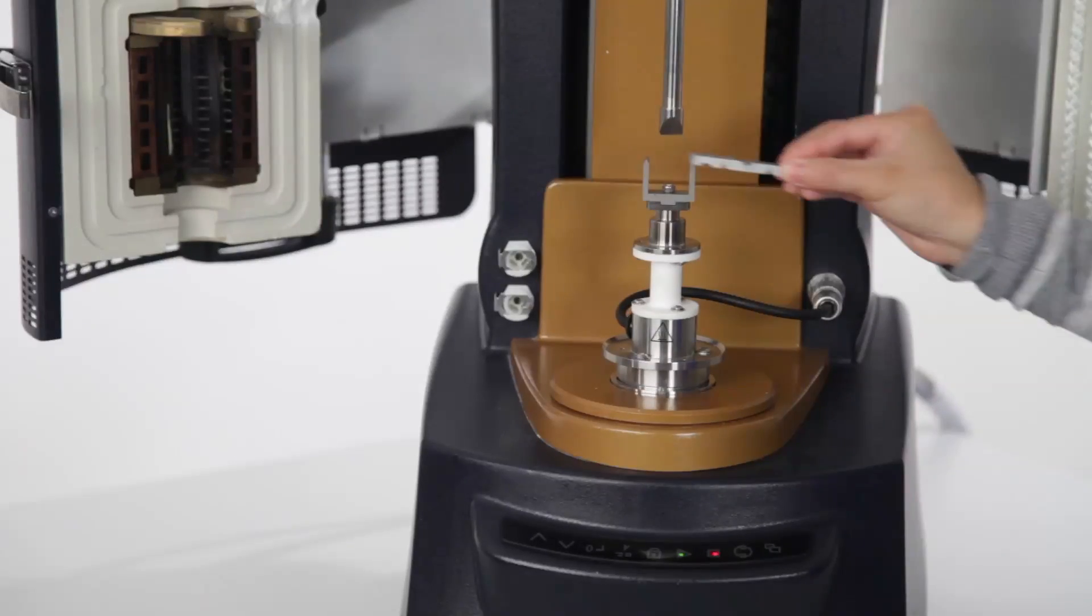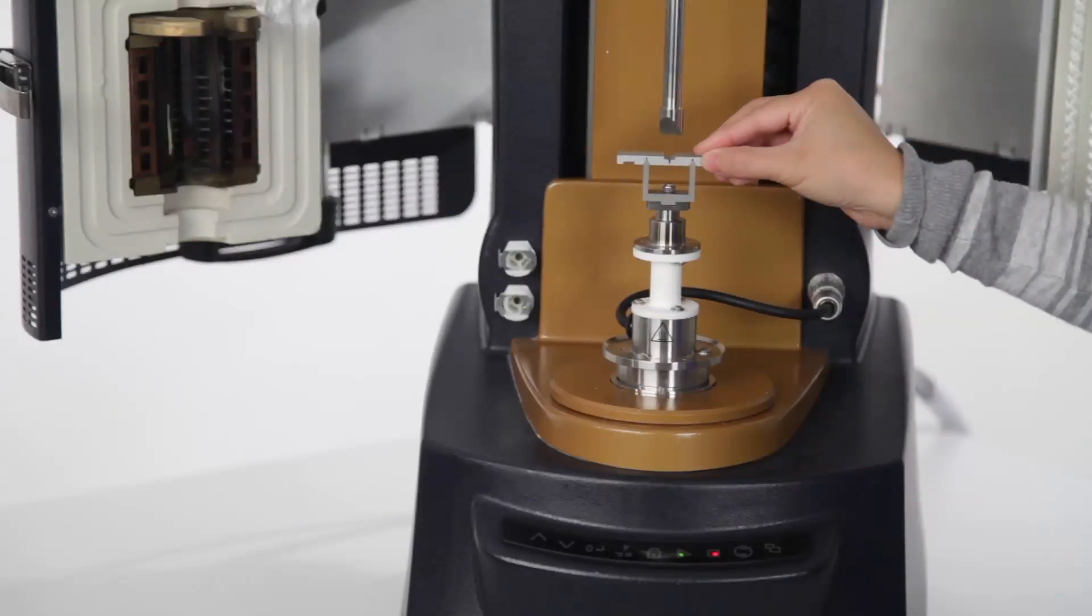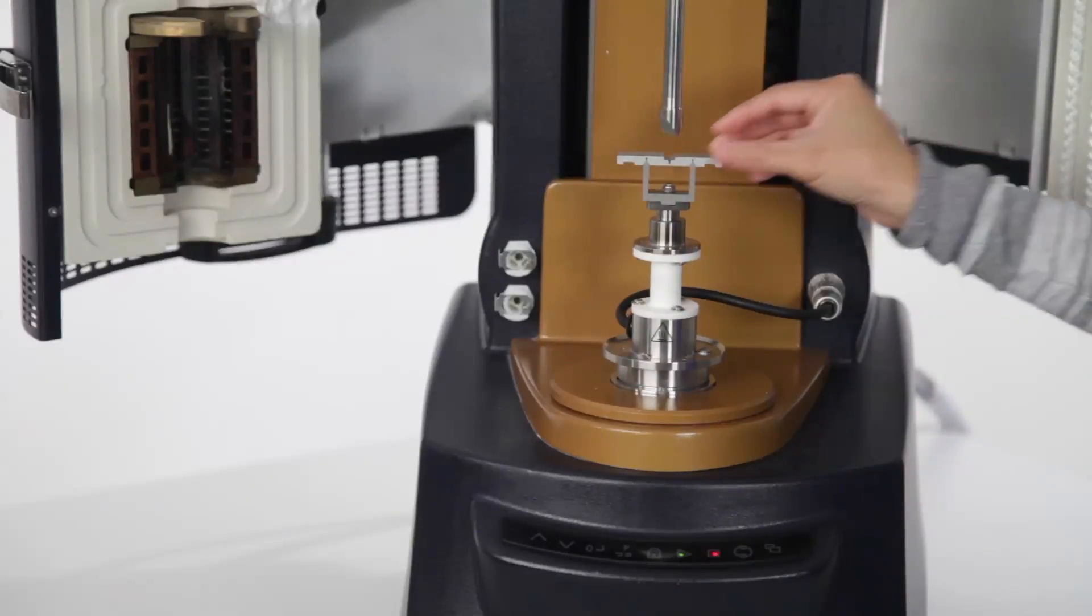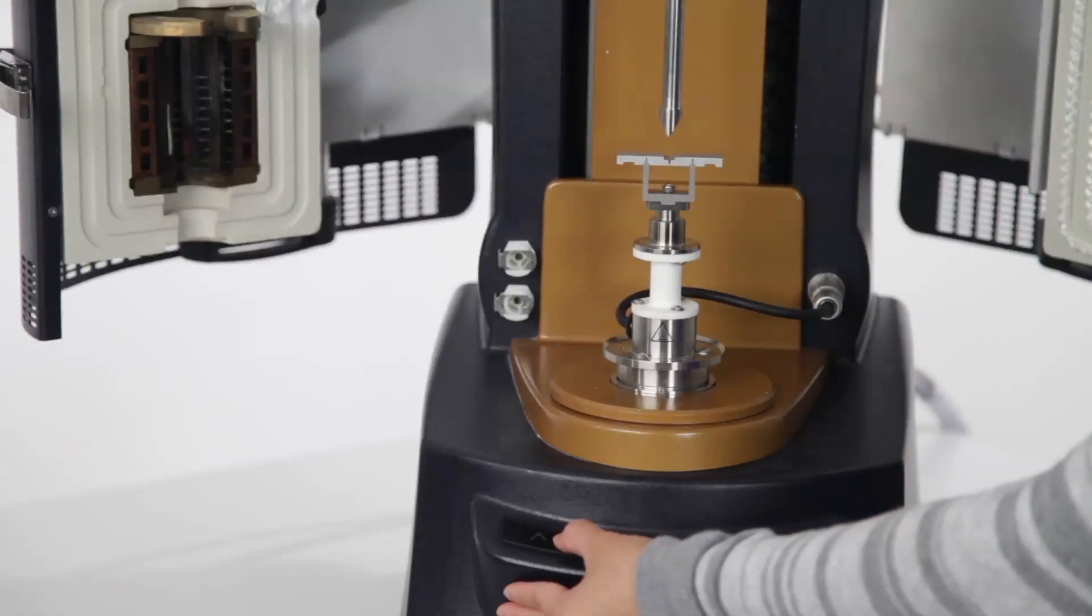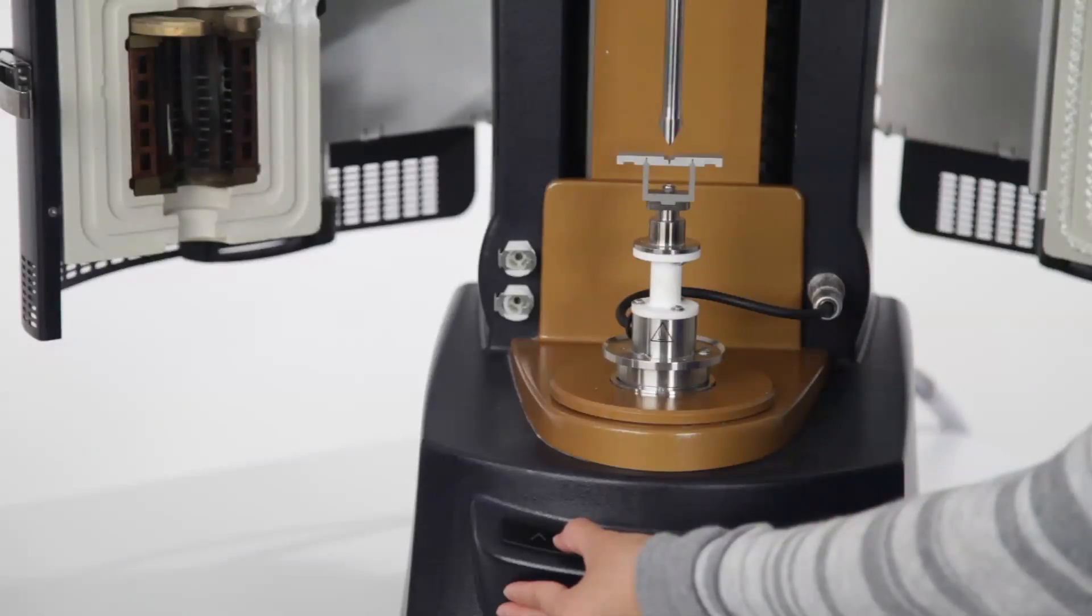Place the alignment tool onto the frame. Then manually rotate the motor shaft to align the upper fixture with the alignment tool.